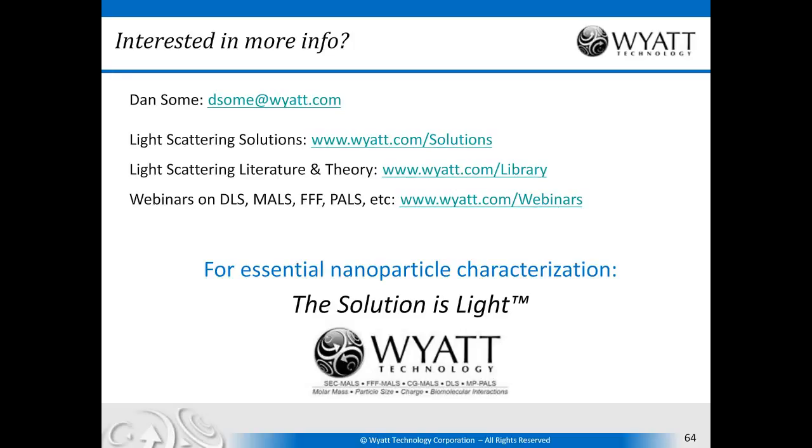If it's a slower aggregation, then you would extract aliquots and periodically put them into dynamic light scattering. If it's an aggregation that is induced, for instance, by the addition of some reagent, then you could use the CG-MALS system to do that combination, inject the mixture into the light scattering detector, stop the flow, and again monitor the change in size and molecular weight through light scattering.